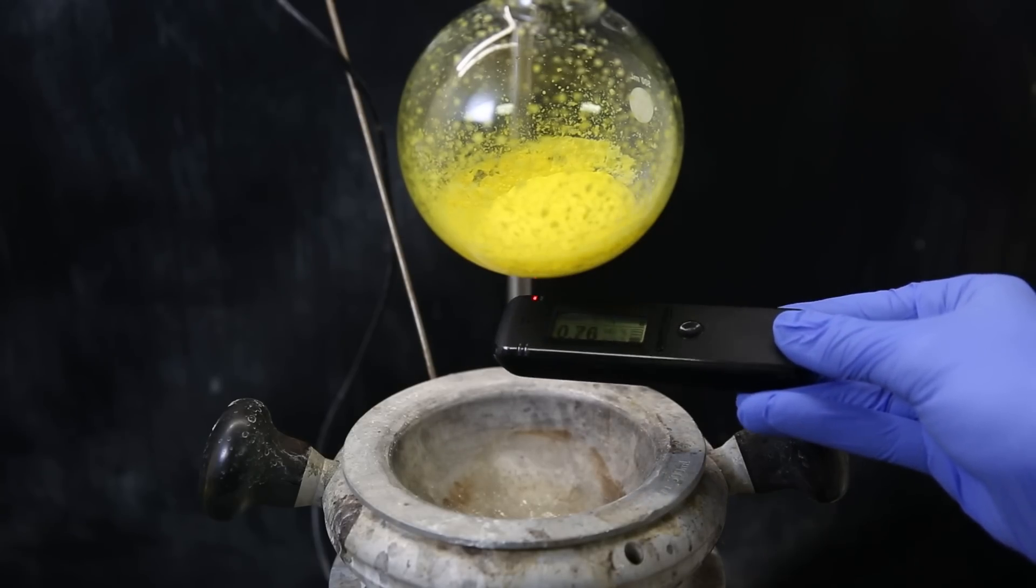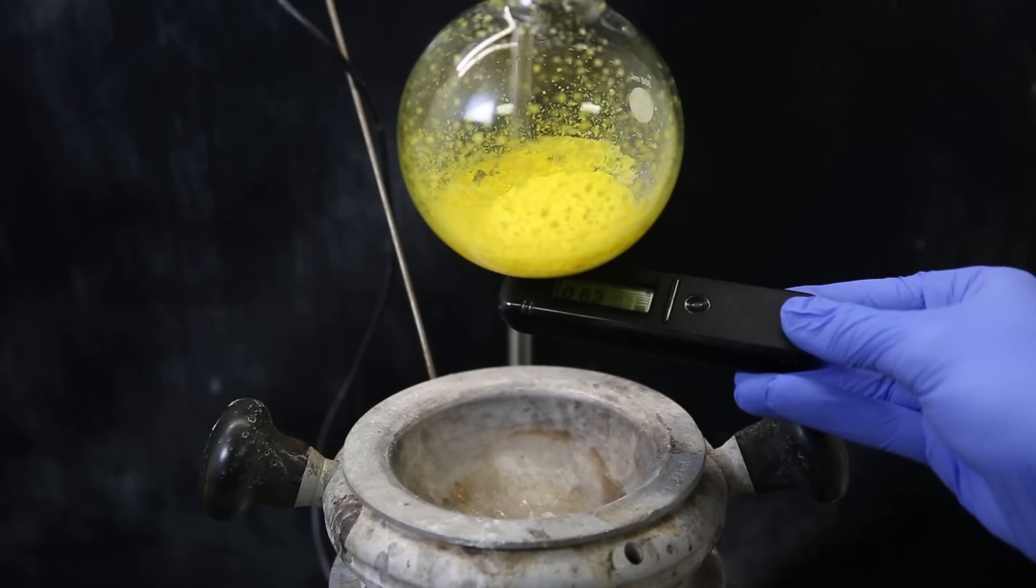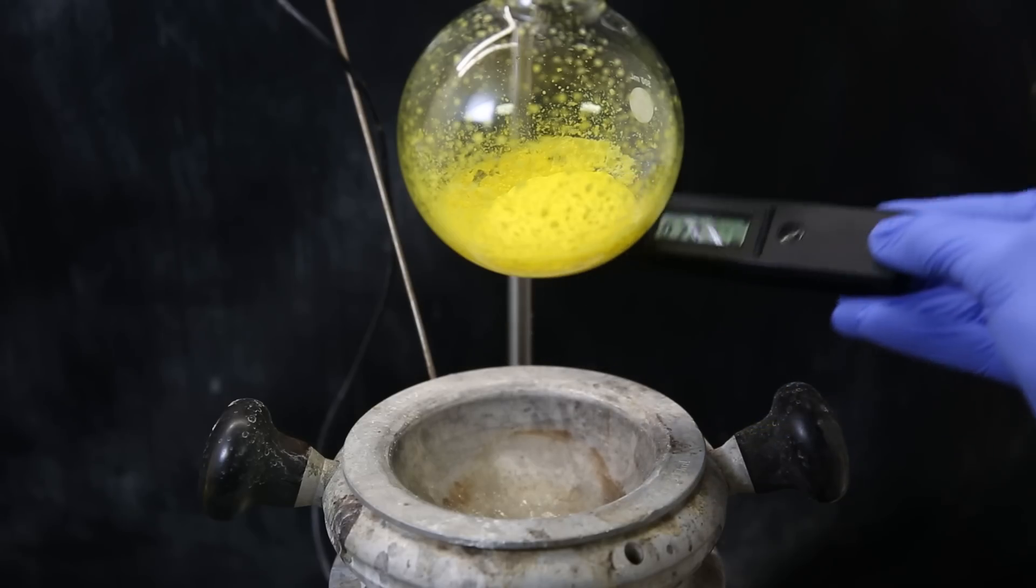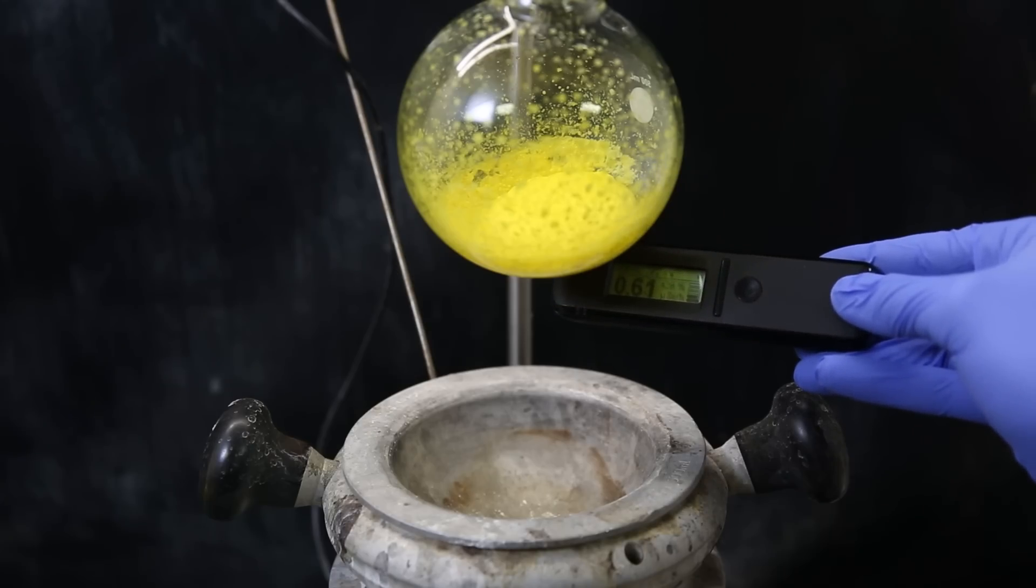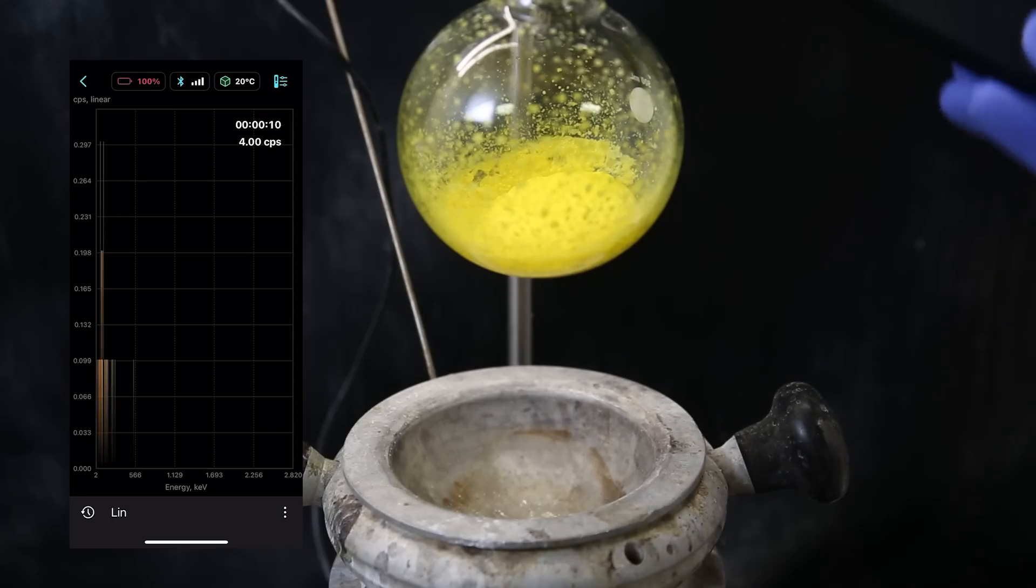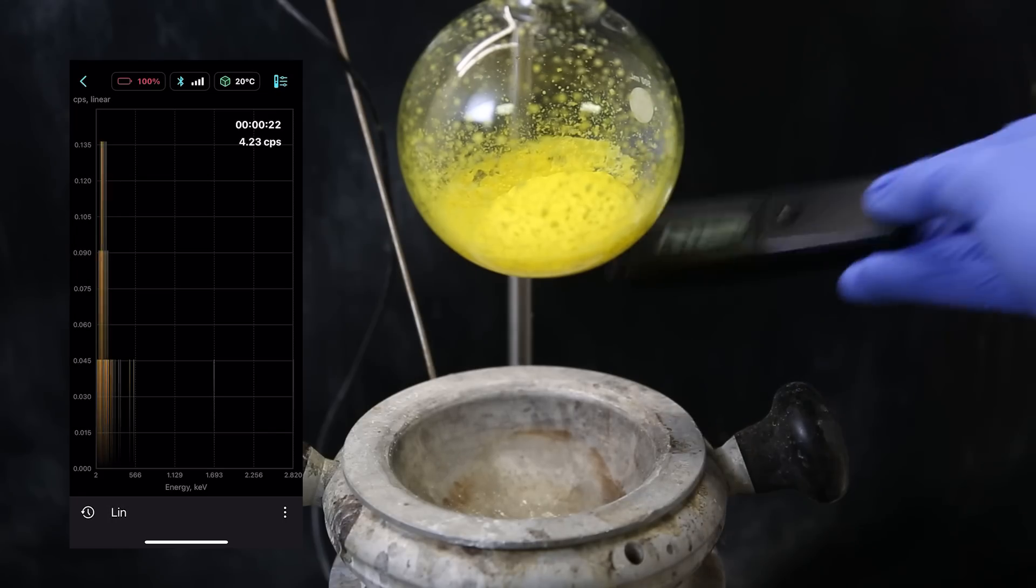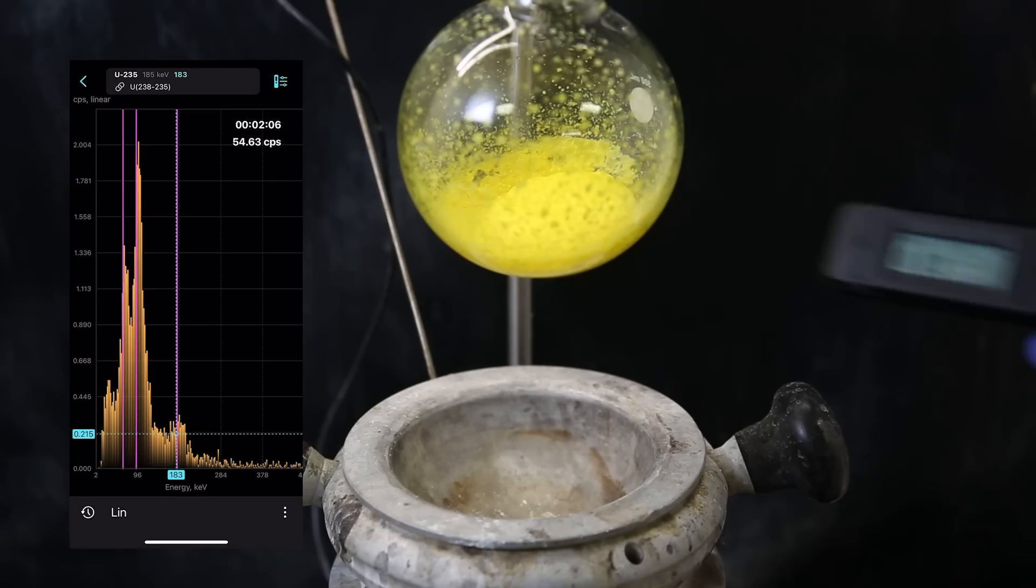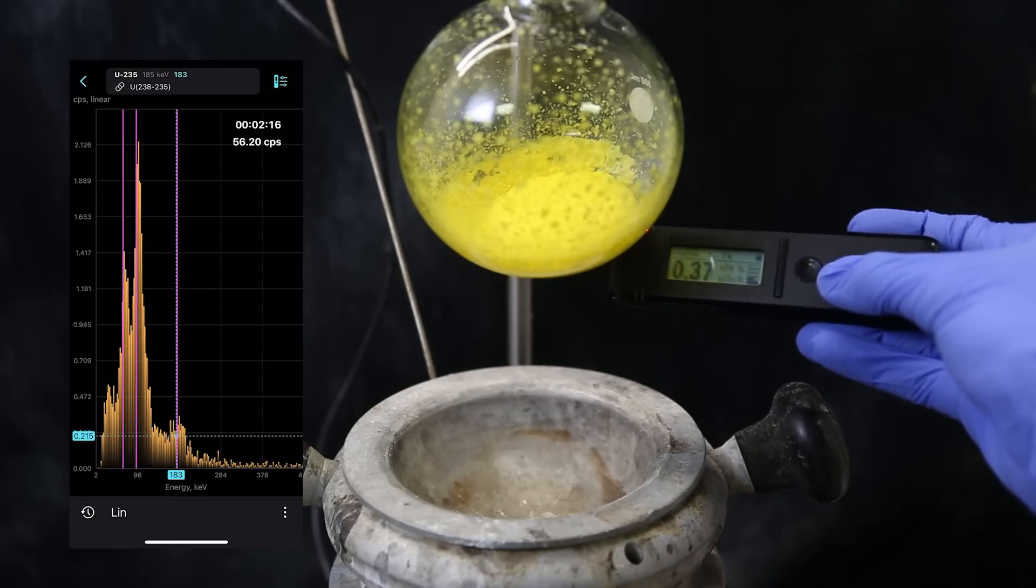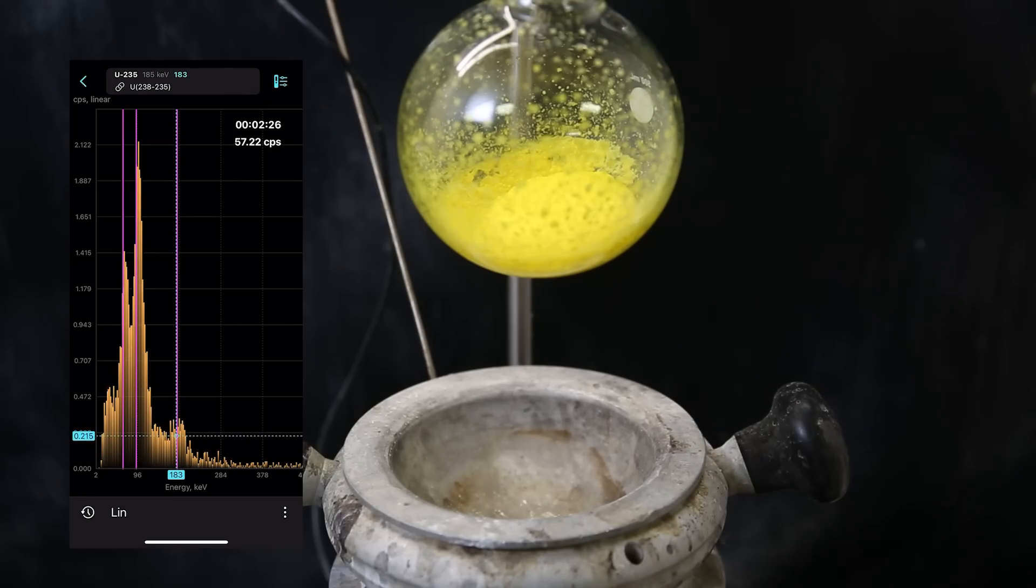Because it's also a spectrometer, we can also identify which radioactive isotopes are in our sample, as they emit gamma radiation at energies that are specific to them. If we allow the Radiocode to measure the radiation for a minute and collect some data, we can see the spectrum in the app and identify isotopes that form from the radioactive decay of uranium. So with gamma spectroscopy, we can confirm that we have uranium in this sample.